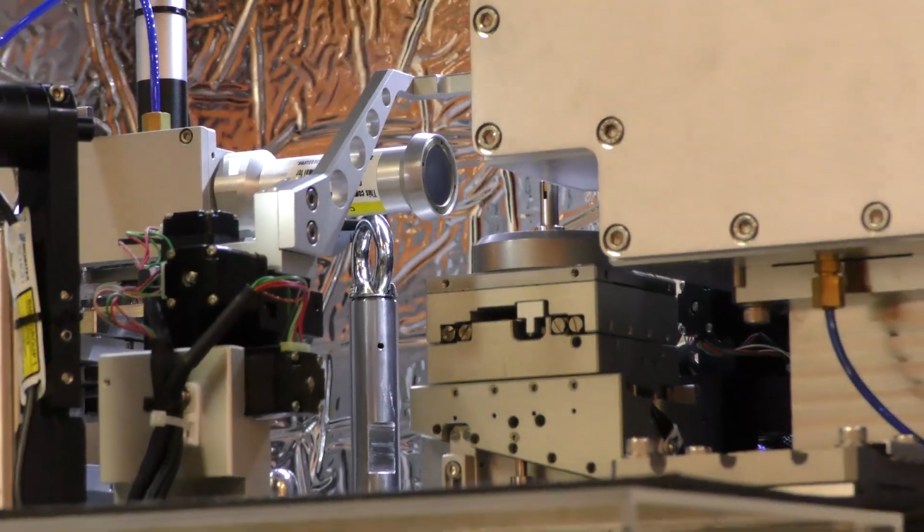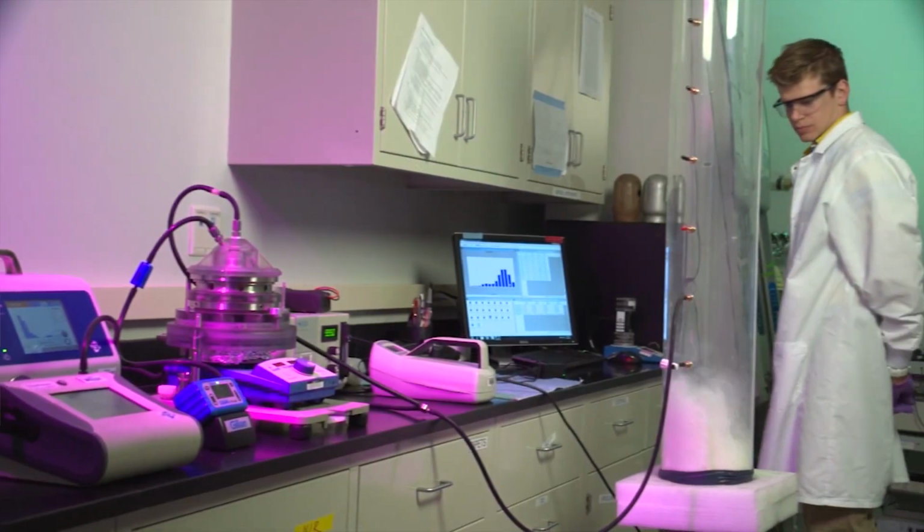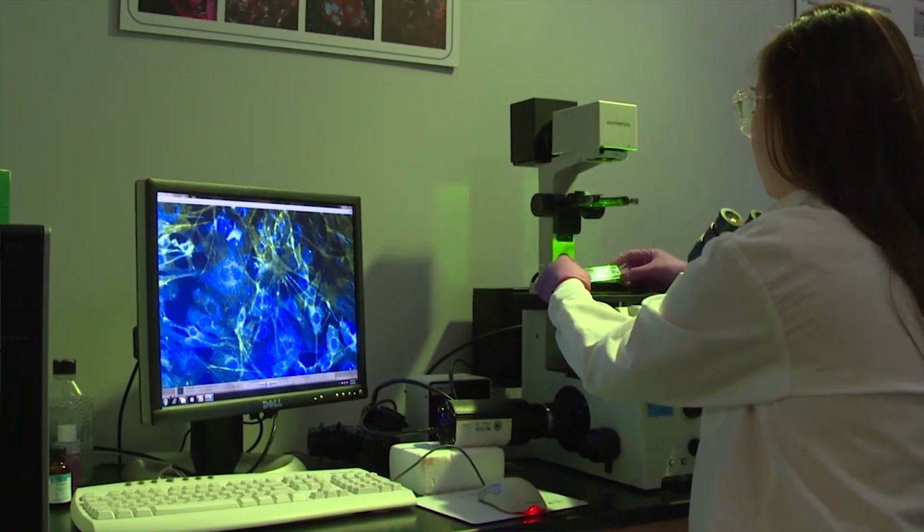And we have different sorts of equipment for all of those different sorts of characterization. So we have X-ray diffraction units, we have optical microscopes, infrared microscopy. I work with chemists, with chemical engineers, with physicists, with electrical engineers. Physics understanding, modeling, statistics and analytics. Machine learning, biology is really, really huge in a lot of the things that we do.